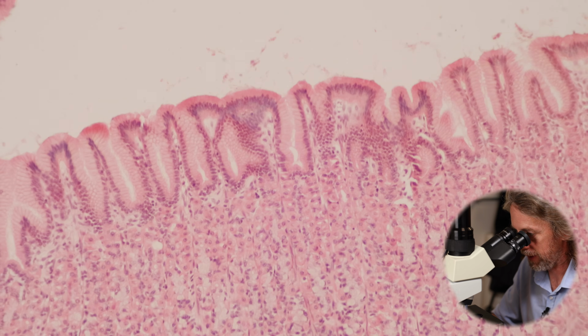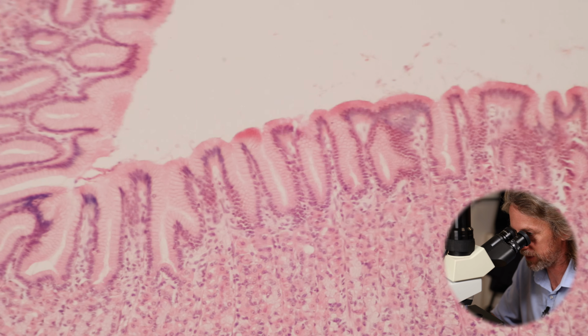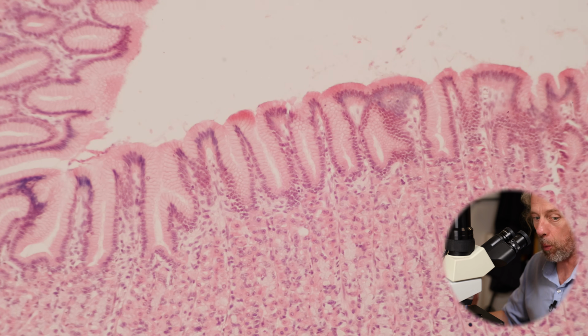Right, okay. So this clearly is the epithelium. And we're seeing some big folds here. It's going to be important that you don't confuse these folds with the folds that we see in the small intestine. They're different, they've got different names. I see the names and the functions get confused quite a bit. But what we're looking at there, we're looking at gastric pits.